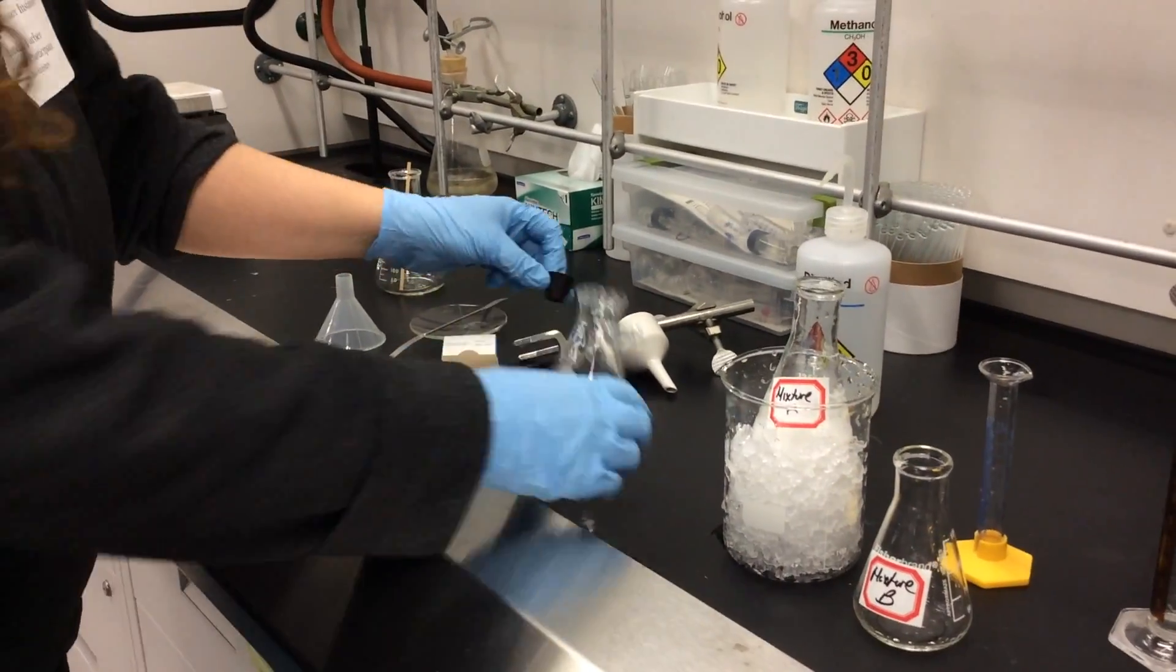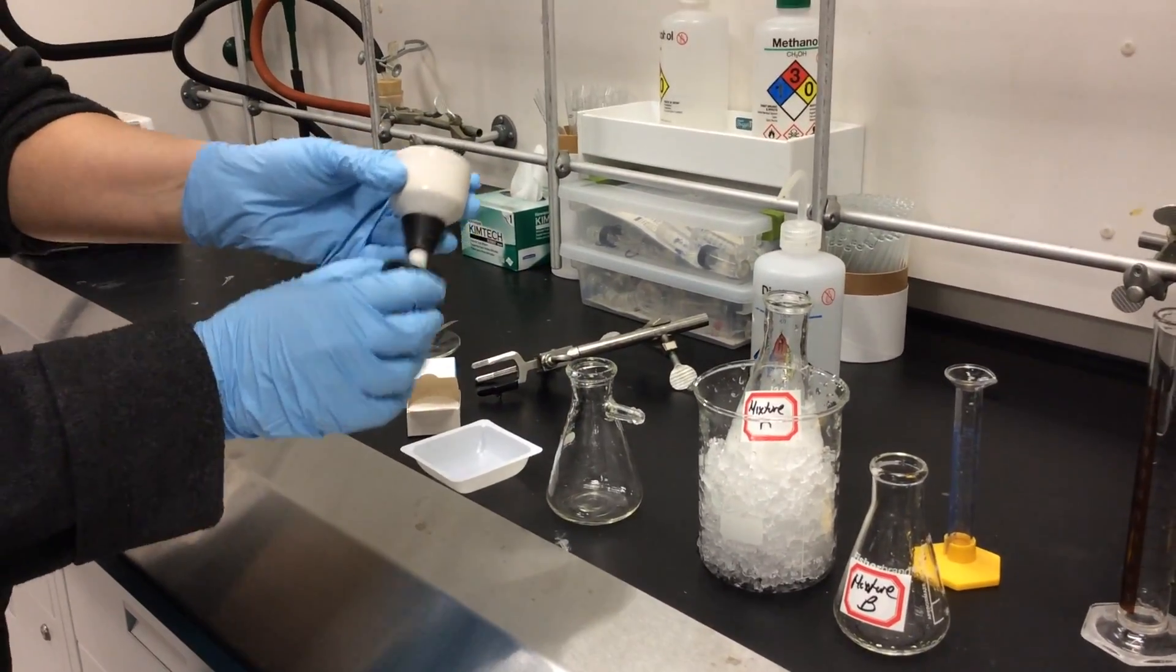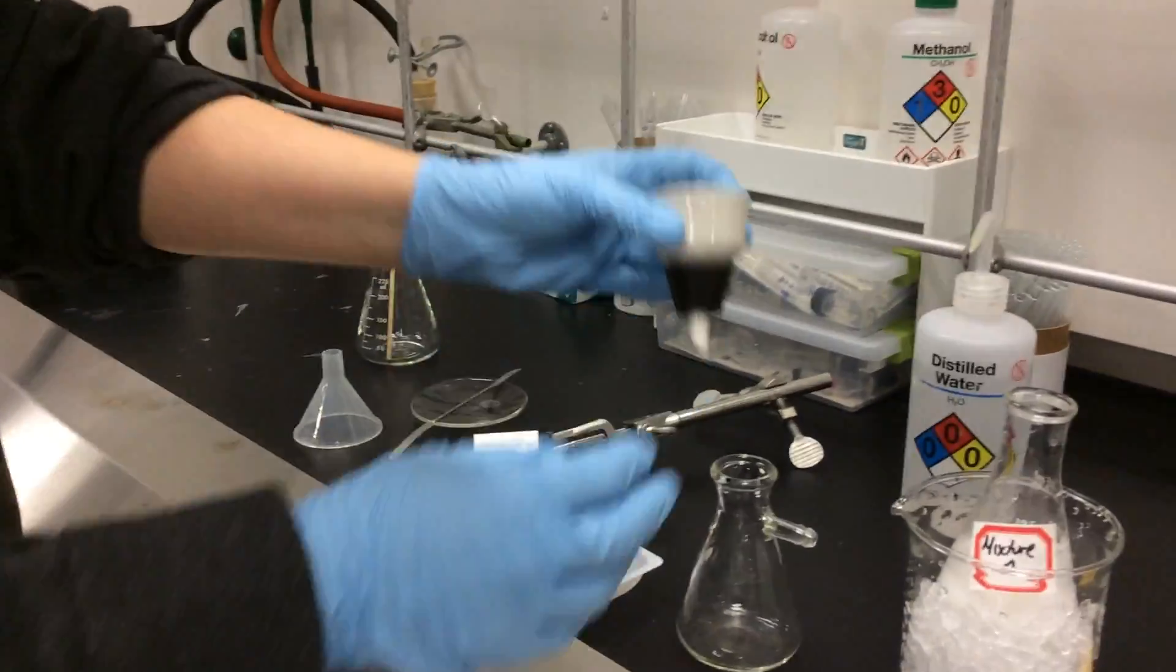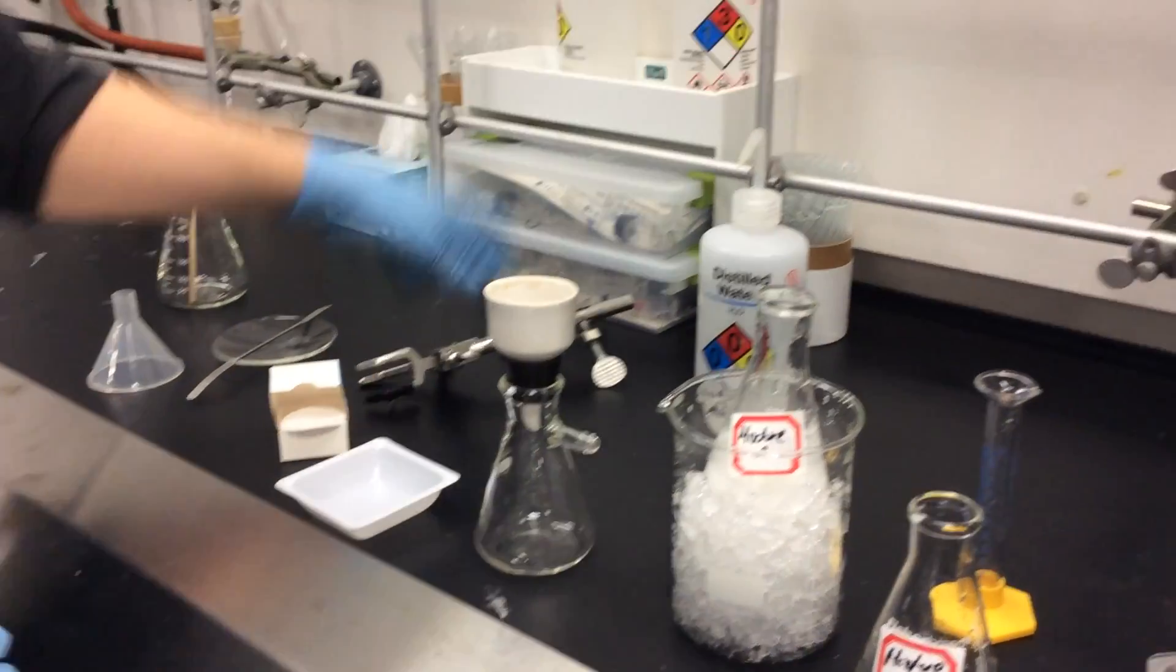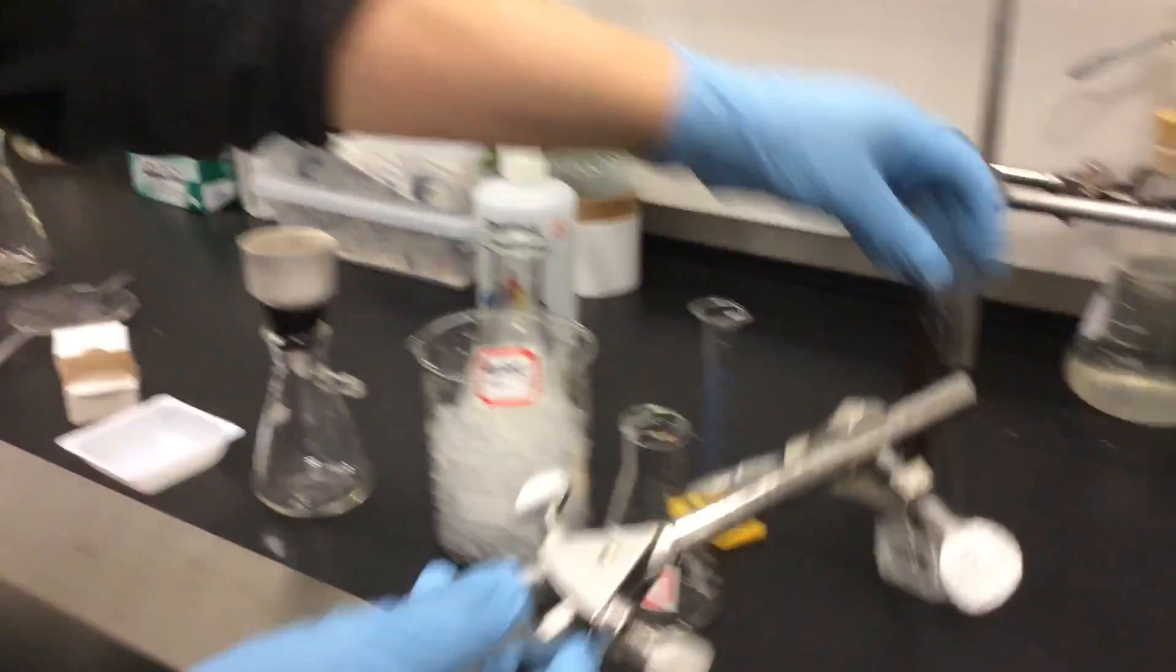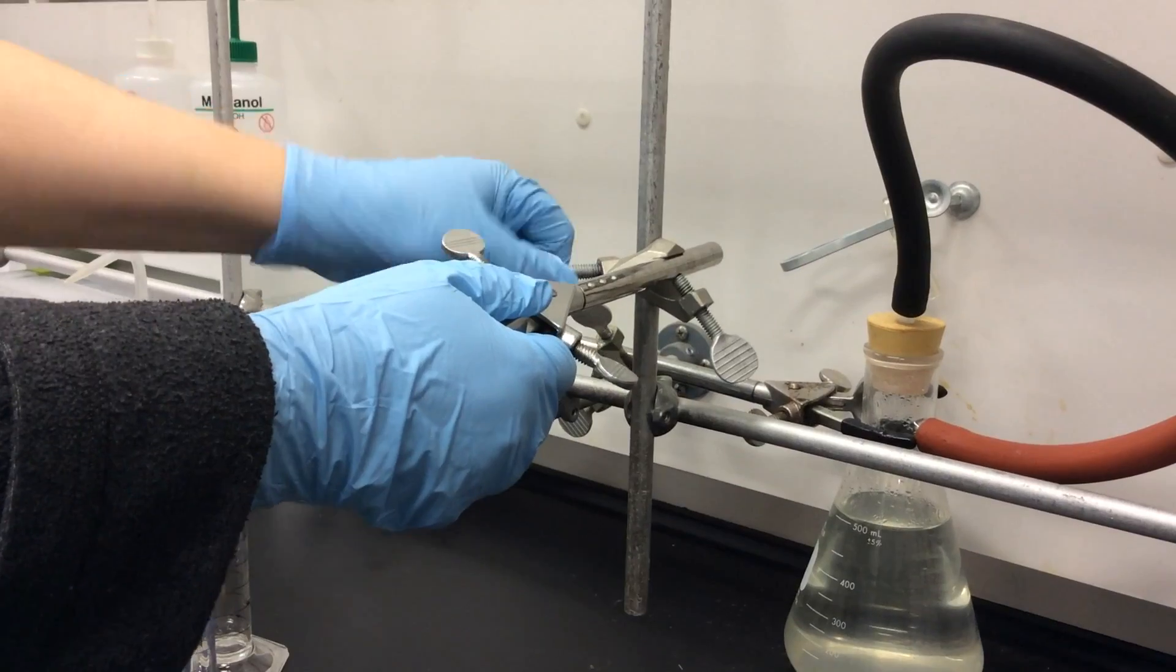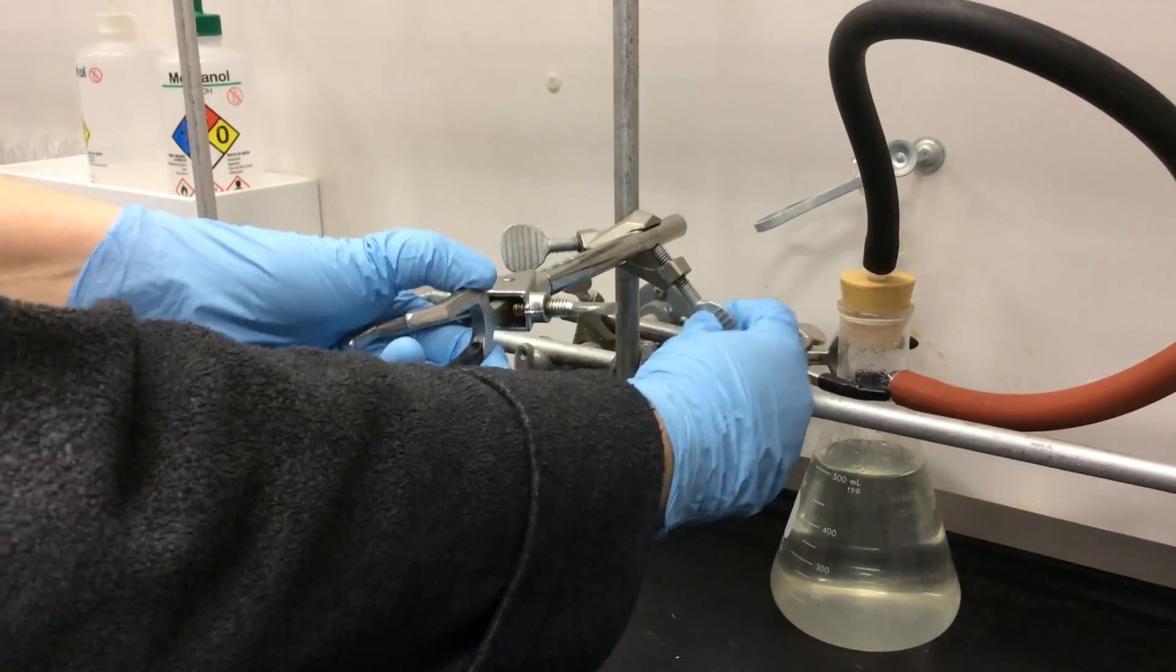You can see a Buchner funnel is being fitted with filter adapters, then into the filter flask. Once that's done, we have to attach it to the back of the hood. We do this with a clamp. We use the clamp to attach to the back of the hood. Once that is secure, we're going to take our vacuum filtration setup, the glassware, clamp it around.